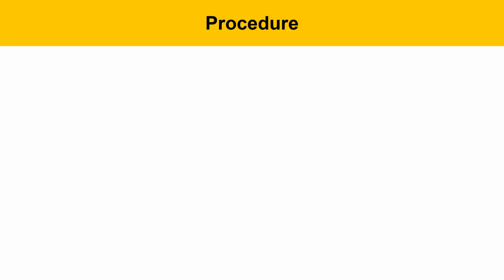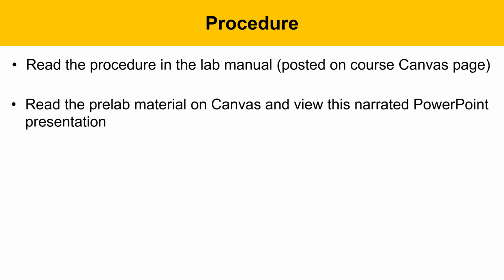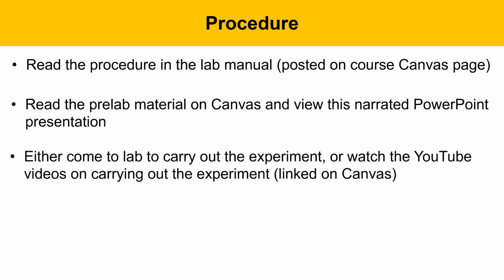The procedure for this lab will involve reading the procedure in the lab manual, and that's posted on the course Canvas page, reading the pre-lab material on Canvas and viewing this narrated PowerPoint presentation. Then you'll either come to lab to carry out the experiment or you'll watch YouTube videos carrying out the experiment. These are on YouTube but also linked in Canvas.